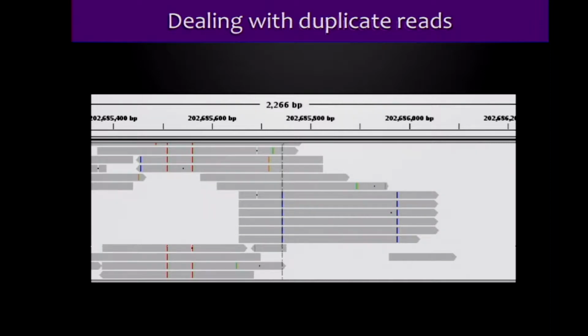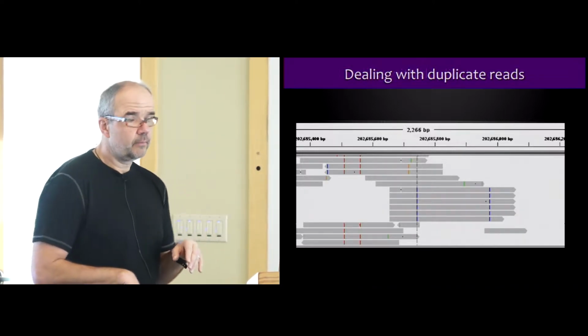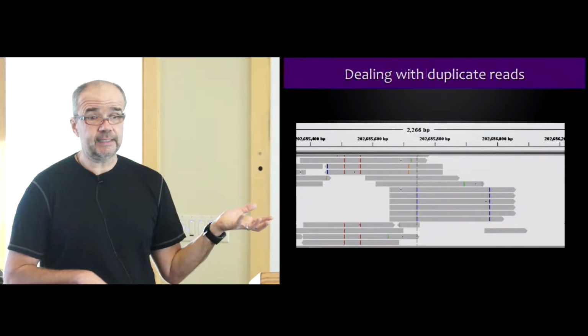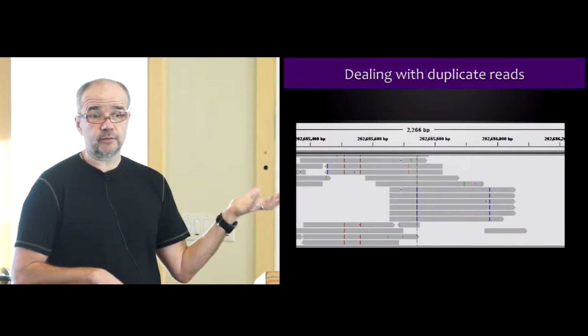And so these are not independent observations of the original DNA. And if there are early PCR amplification errors, then these amplification errors get incorporated and will look like genetic variations. Okay? So this is again a problem that has to a great degree gone away, and good sequencing now means that the rate of PCR duplicates is very low. But in many situations you don't have enough DNA, so some very precious tumor sample, low purity tumor sample, etc.